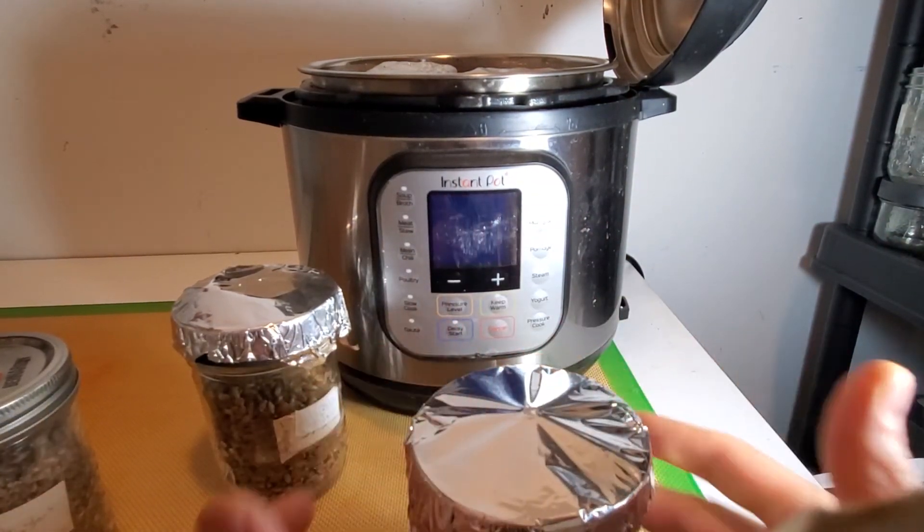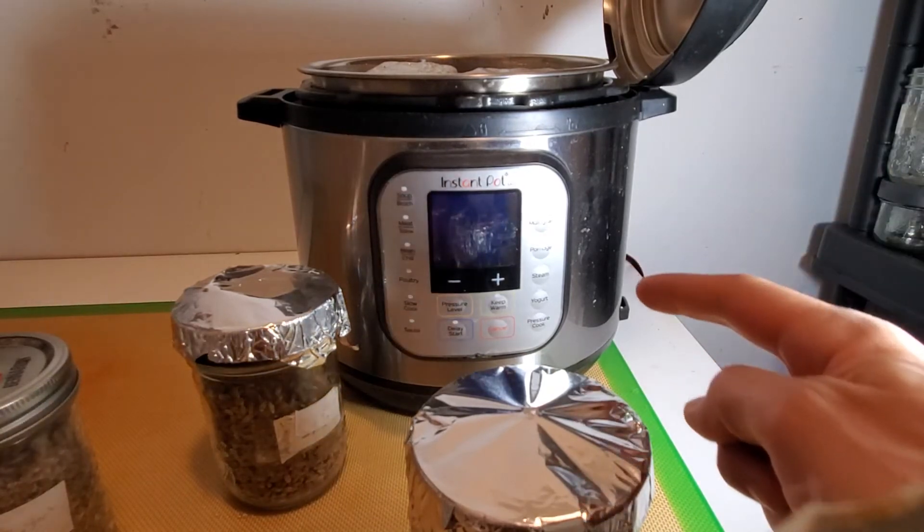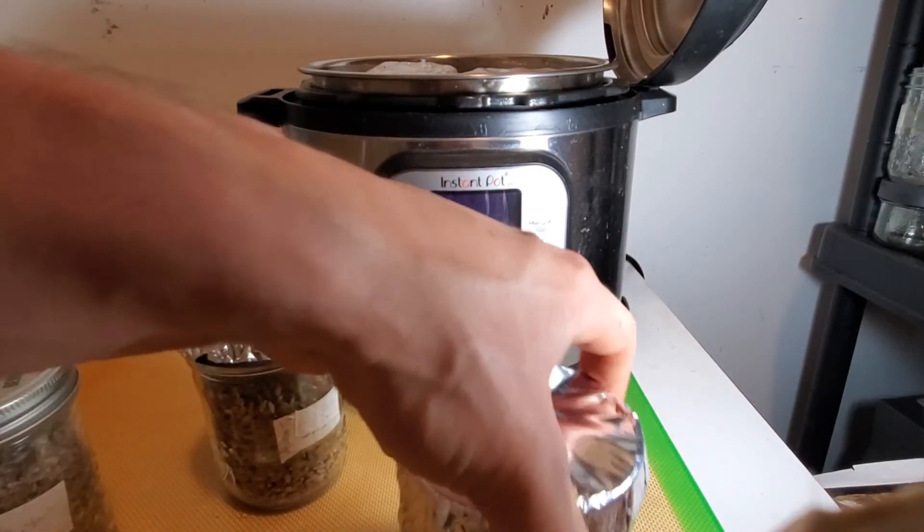Now it's ready to load into the pressure cooker. I've placed the steaming rack inside and filled up water just above it.